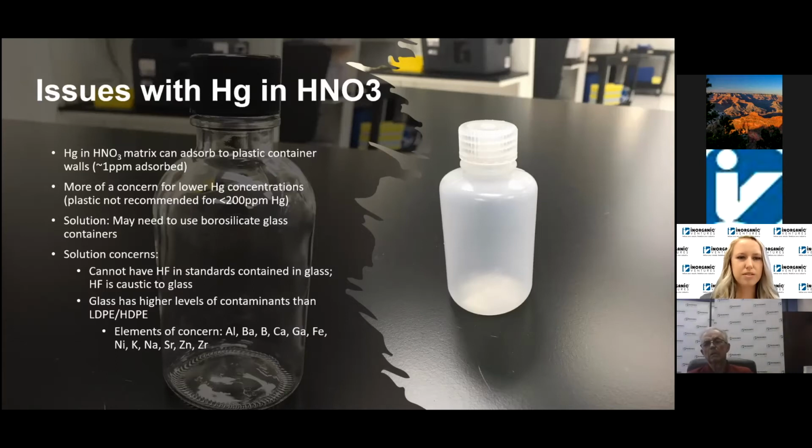Another issue with using glass containers is if you have HF in your standards, these are not going to be compatible with glass because the HF is going to be caustic to the glass. So you're going to leach out all those impurities that you don't want and also potentially compromise the integrity of the container as well. So just some things to consider if you do want to use mercury and nitric in glass containers.